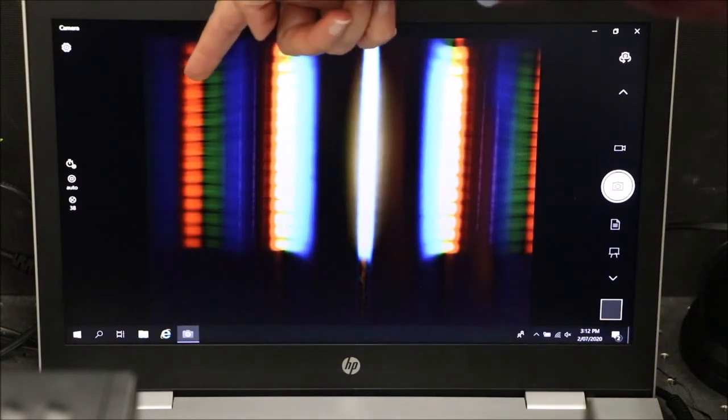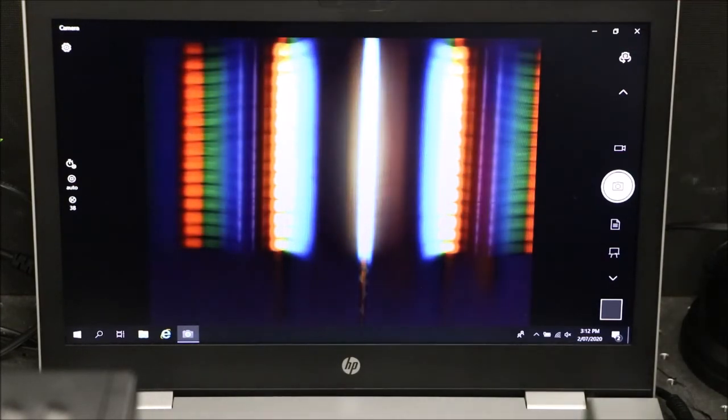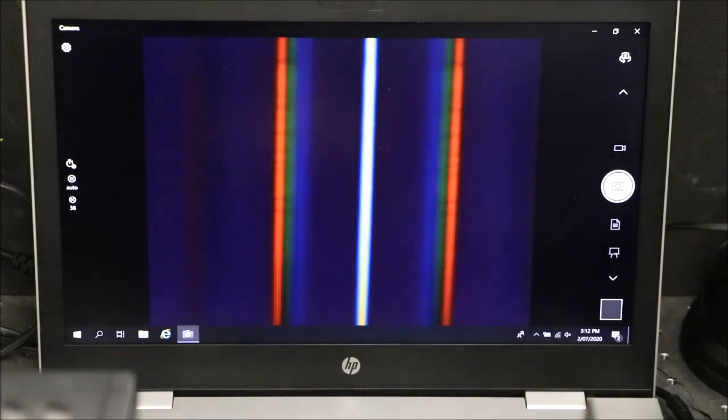You can see that here we have an image of the filament. To get rid of that we will put the diffuser onto the white light source.